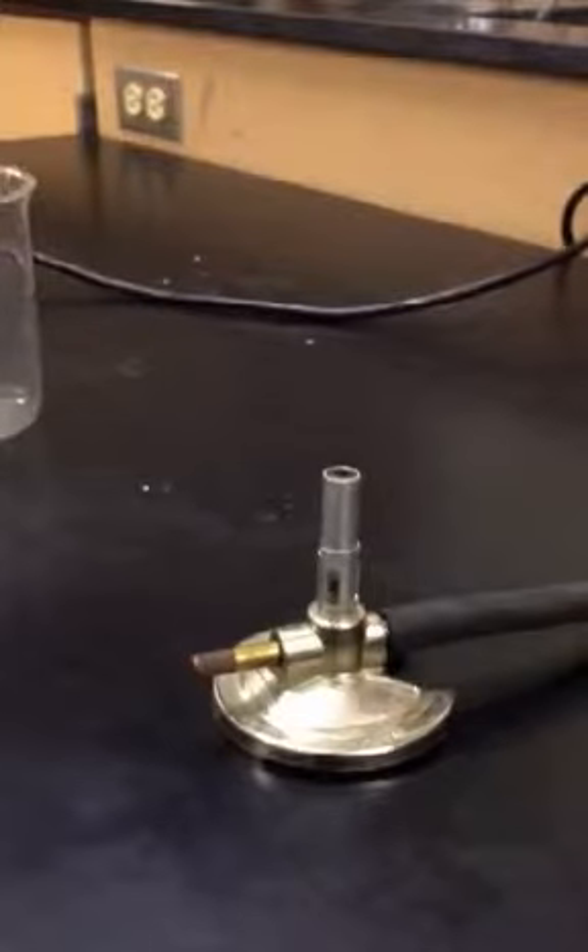Everyone, when you start your Bunsen burner, make sure that it's plugged into the wall and turn the wall gas on.